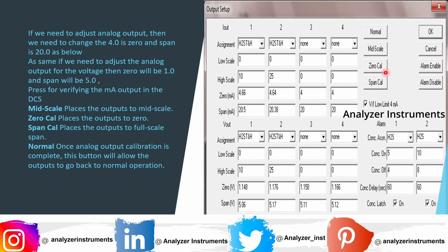Now we need to stimulate the analog output and verify with the multimeter as well as in the DCS. Press Zero Cal — once pressed, it will show 4 milliamps on the multimeter and the DCS will read 0 ppm, since the low scale is 0 ppm and the high scale is 10 ppm. Next is Mid Scale — once you press Mid Scale, the DCS will read 5 ppm and the multimeter will read 12 milliamps. You can verify this reading.